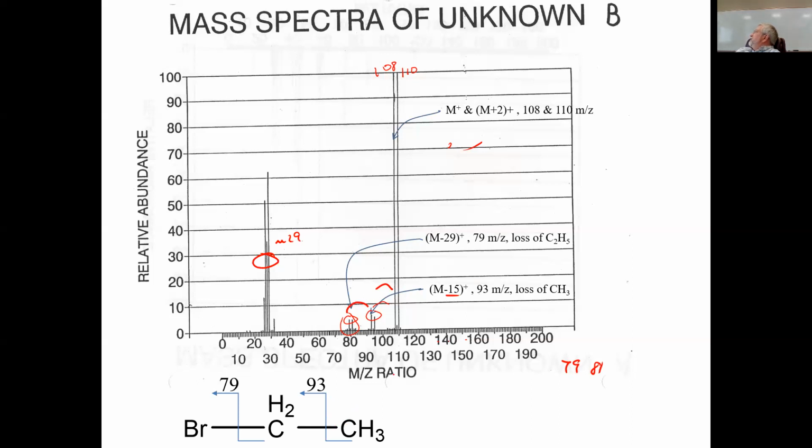One of the things is, if you have bromine or chlorine or fluorine, these are fairly electronegative. And when they fragment and leave a molecule, sometimes they take a hydrogen along with them. That makes sense because it's trying to stabilize itself. And so there's maybe a peak at 28 here, as well as 29. And there's hydrogens, I don't know, things go on.